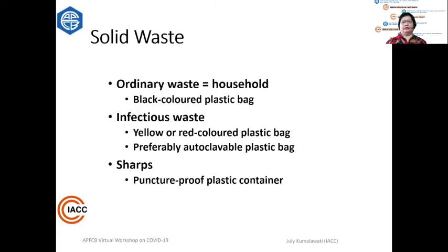For solid waste, there are three types. Ordinary waste, like household waste such as paper — use a black plastic bag. Infectious solid waste — use autoclaveable plastic bags in yellow or red color. For sharps, use puncture-proof plastic containers.